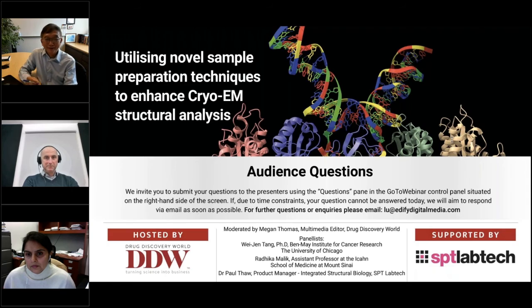For example, like Dr. Malik's IDE, we had to optimize the sample, optimize the fab, and optimize the grids, plus chameleon. That took about 2 years to even get a good enough map to solve the structure.